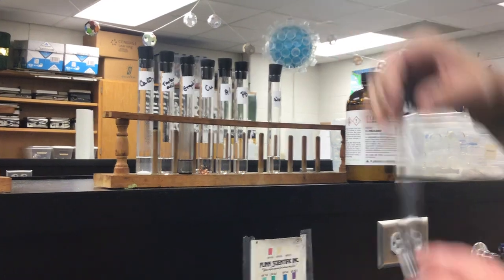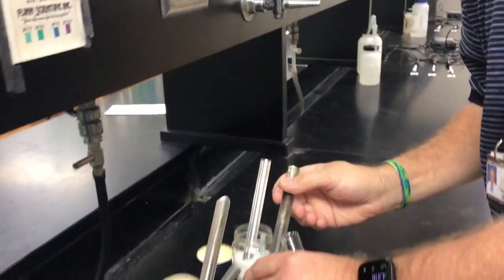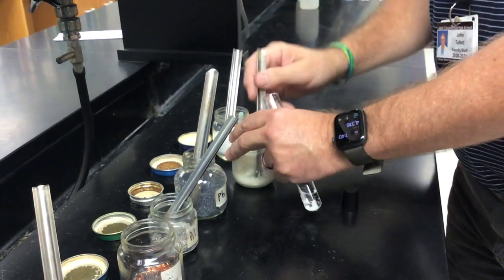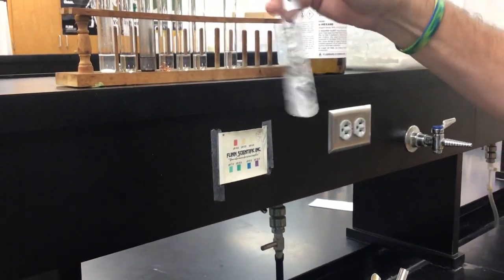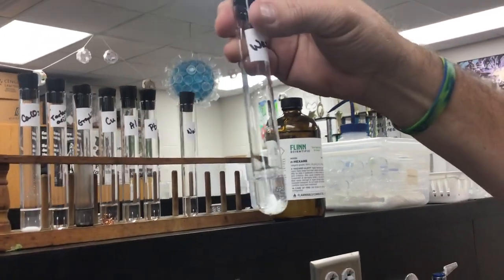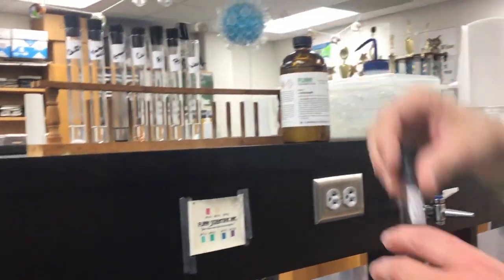And wax, and then finally we'll do NaCl after the wax. So the wax, drop, that's a lot. Let's just drop a little bit in there. And then let's drop a little wax in there. Let's get the wax in there. We'll let that sit for a little bit and we'll come look at it again. And last would be the NaCl.